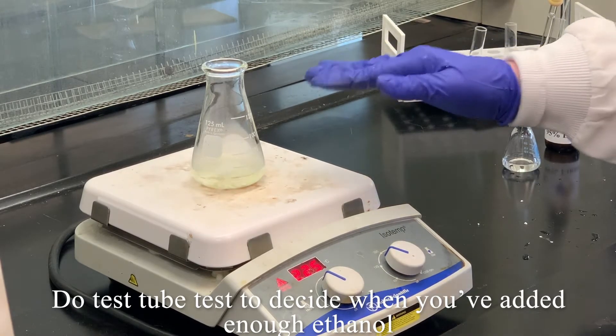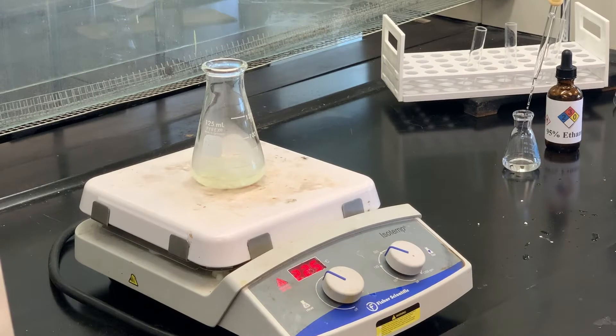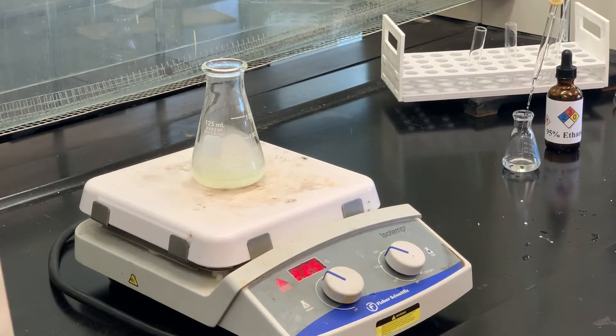We've got two main isomers we're trying to separate: the ortho isomer and the para isomer. The para isomer has very little solubility in ethanol — it's more soluble hot than it would be cold. So what happens is that the para isomer, since it has the lowest solubility in ethanol, will precipitate or crystallize first.